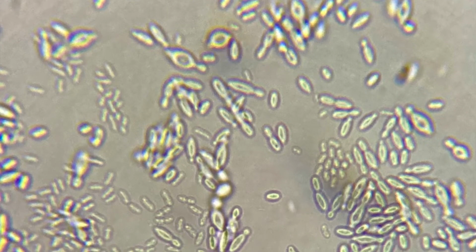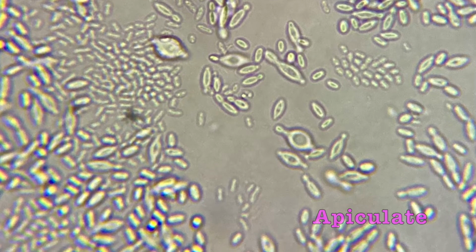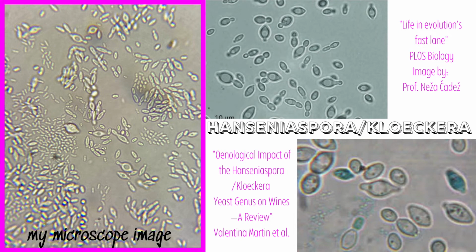What was interesting is that earlier this week, I had looked at the juice that was wild fermenting, and the cells had a completely different shape. They were much more apiculate, so shaped like a lemon. I'm not even sure I'm using apiculate properly in a sentence, but they were shaped more like a lemon. That would lead me to believe that it was probably the species of spoilage yeast called Hanseniaspora, also known as Kloeckera. I'm not even sure that's how you pronounce either one of these.